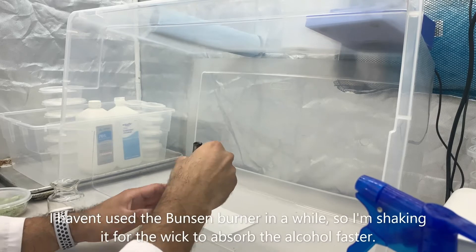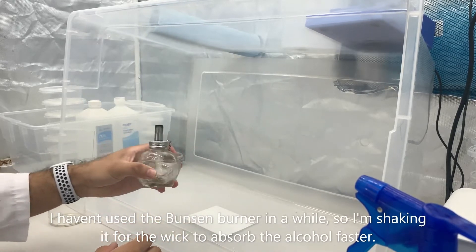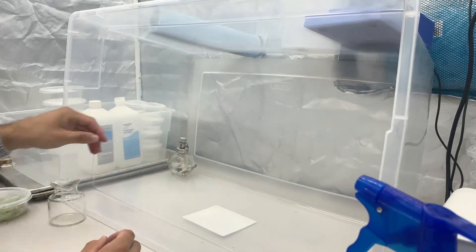Since we haven't used the Bunsen burner in a while, I'm shaking it for the wick to absorb the alcohol a little faster. This would be good practice if A, you haven't used it in a while, or B, if you're brand new to using it.